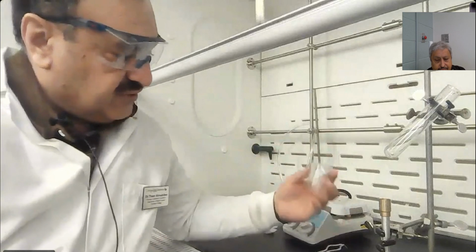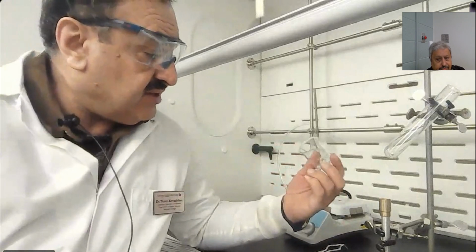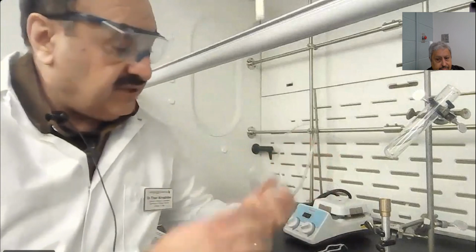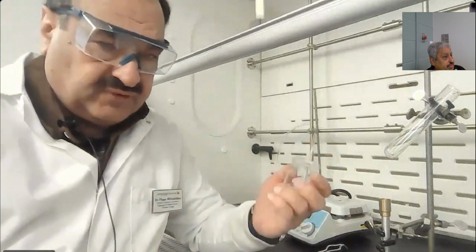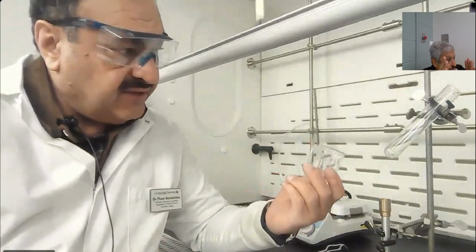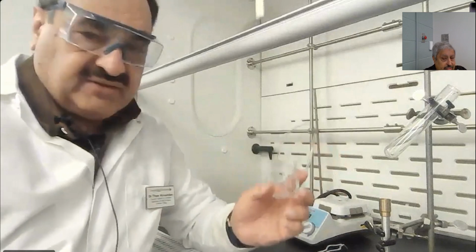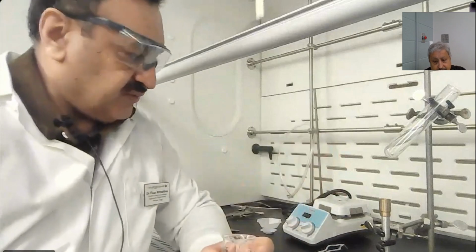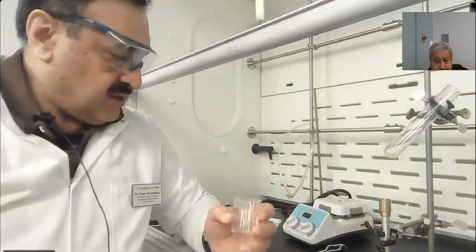Make sure that you put the beaker on the balance and start the balance. Check the mass of the beaker without any materials. Okay.